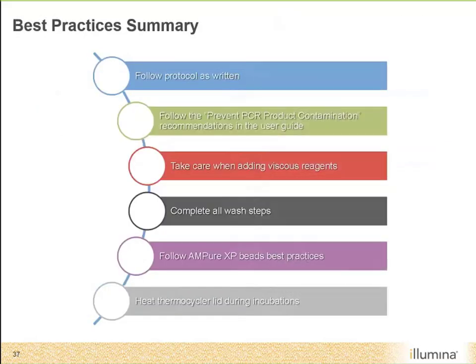So just to summarize some of the best practices that we talked about today, we want to make sure that we're following the protocol as written. We want to make sure that we're following the steps to prevent PCR product contamination that are listed in the user guide. We want to take care when adding viscous reagents. We want to complete all the recommended wash steps that are within the workflow. We're following best practices with our beads, and we have a heated lid during any thermocycler incubation.